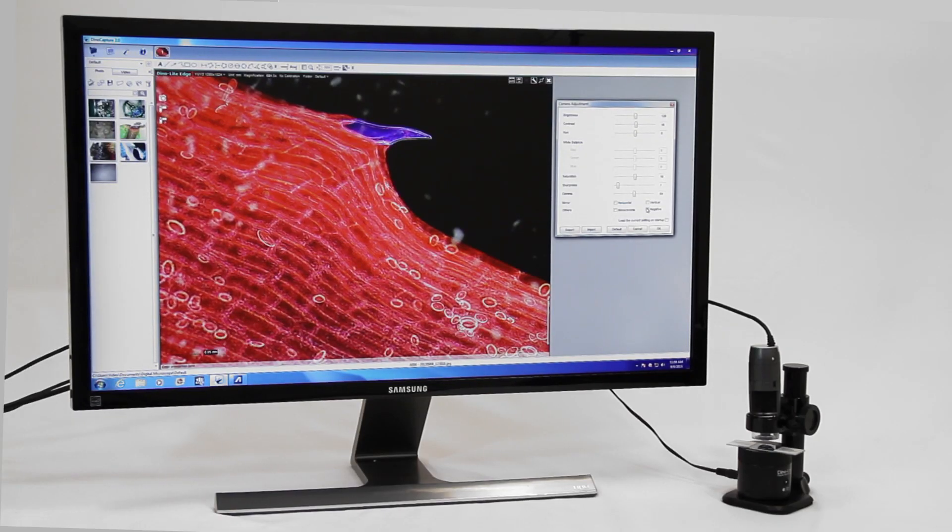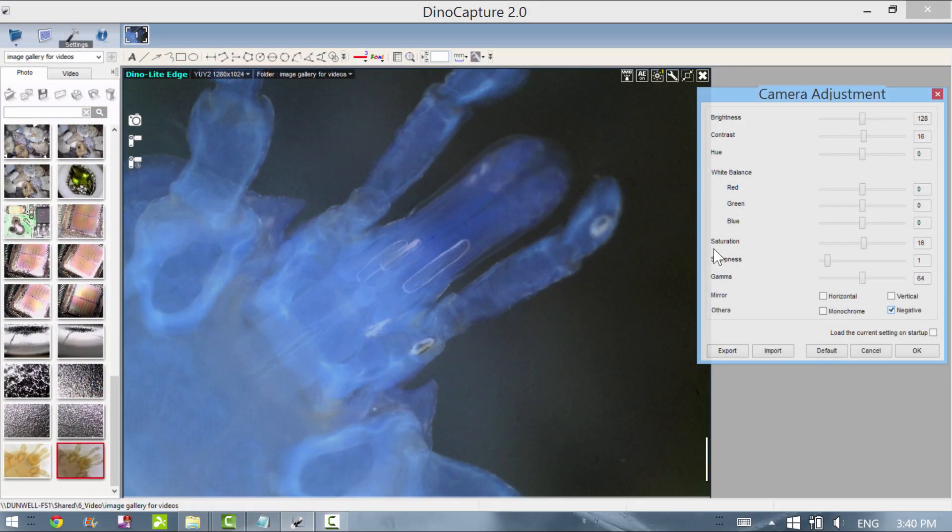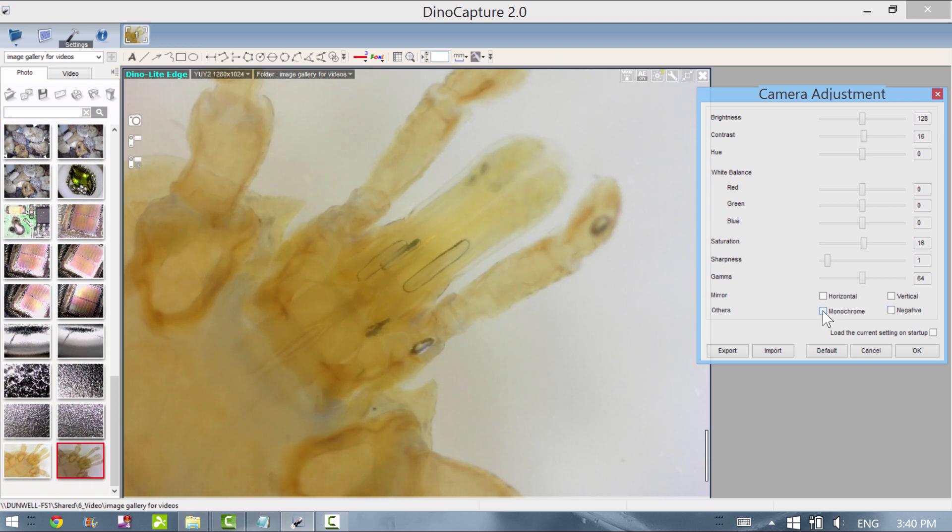The Dynolite capture software also includes other imaging features such as monochrome, negative, and more.